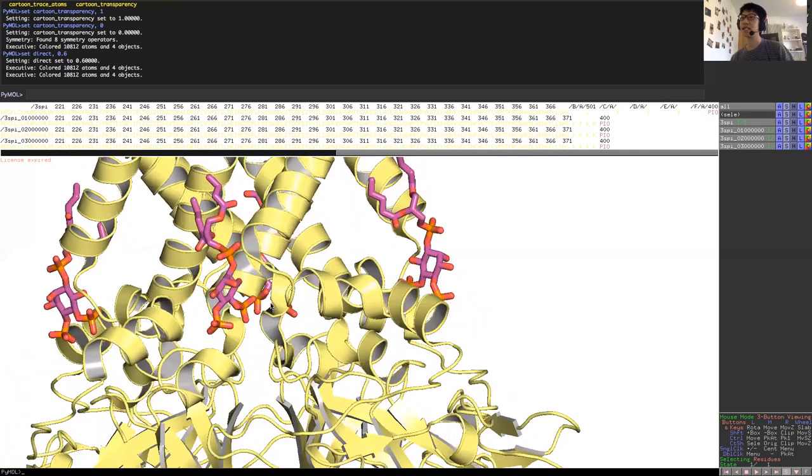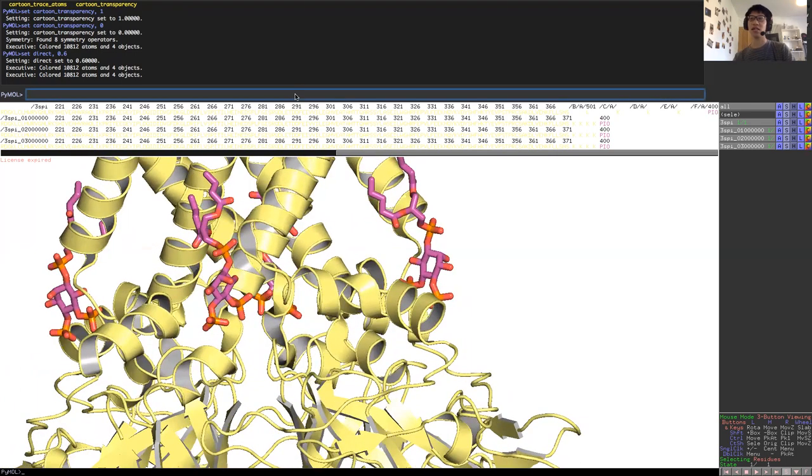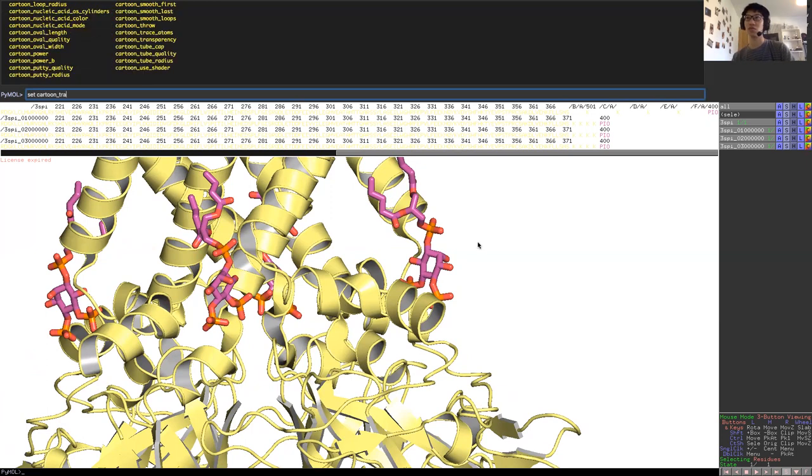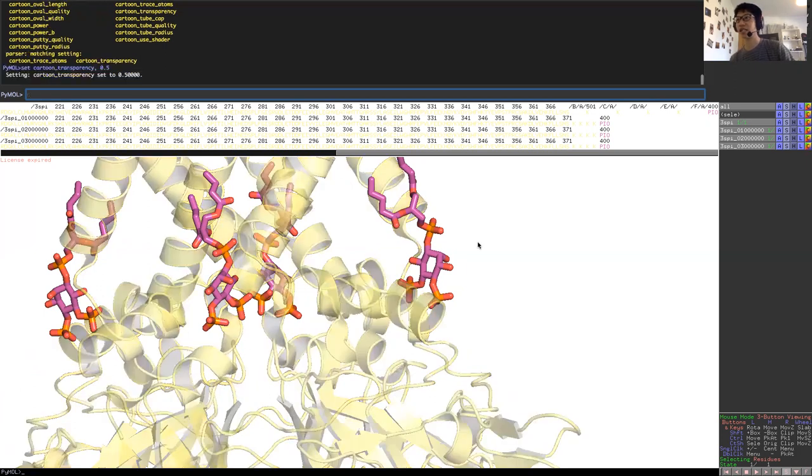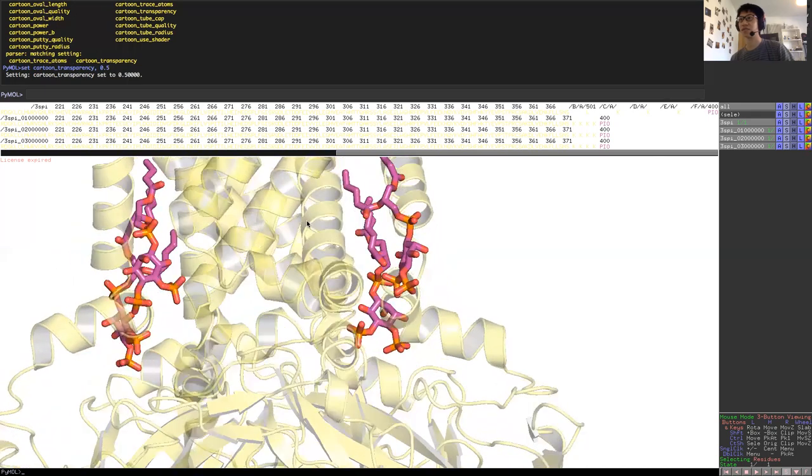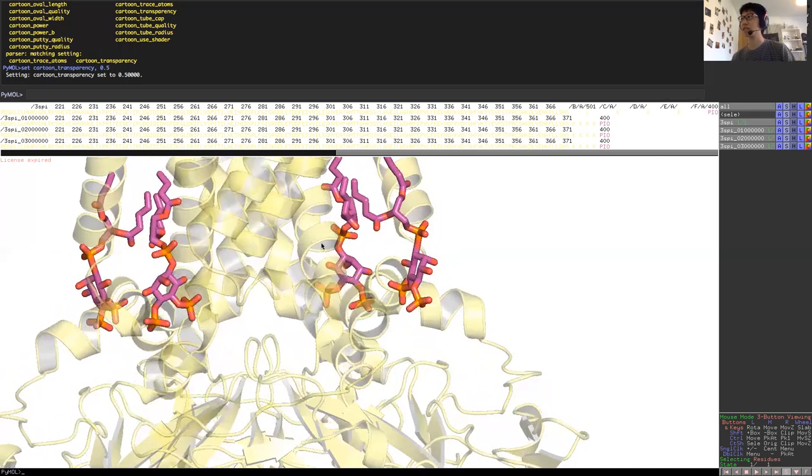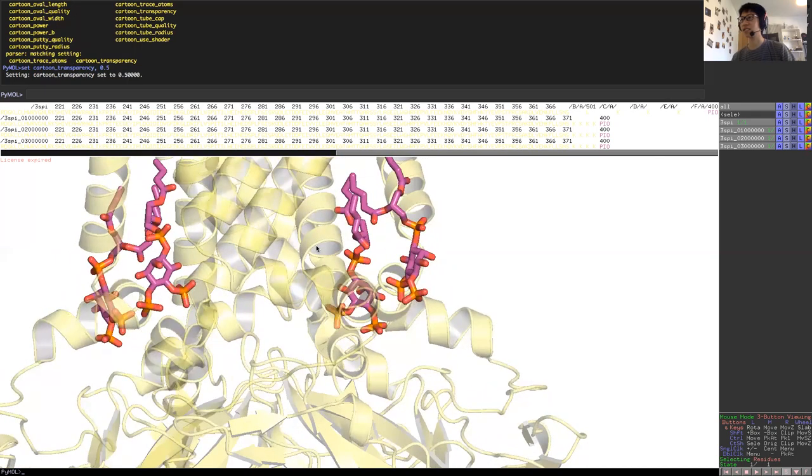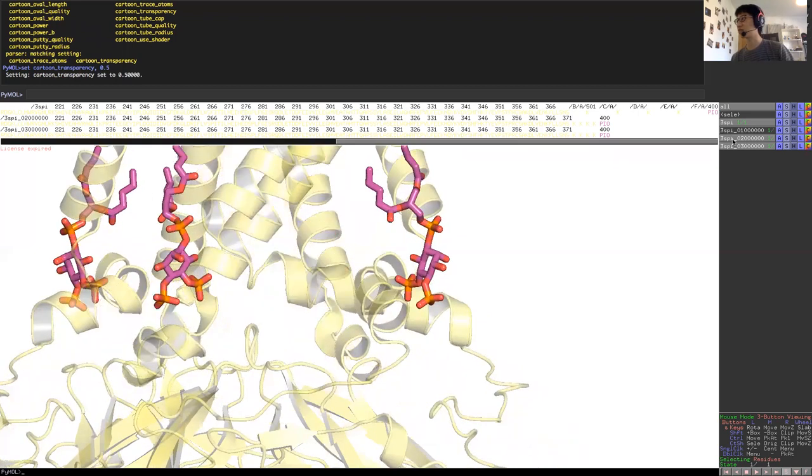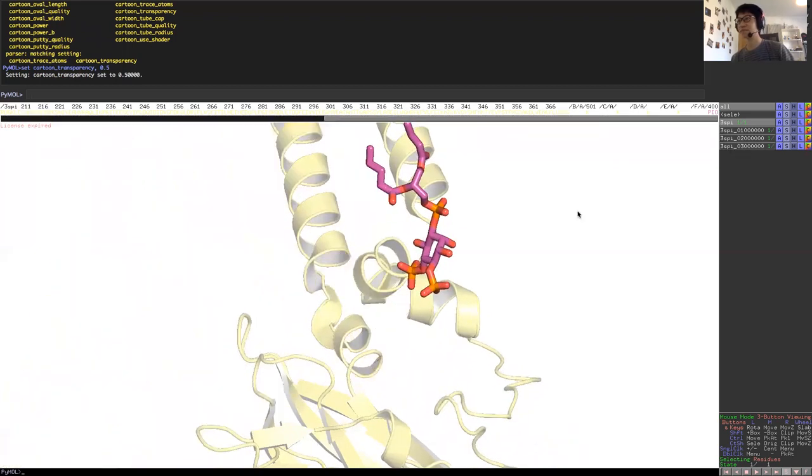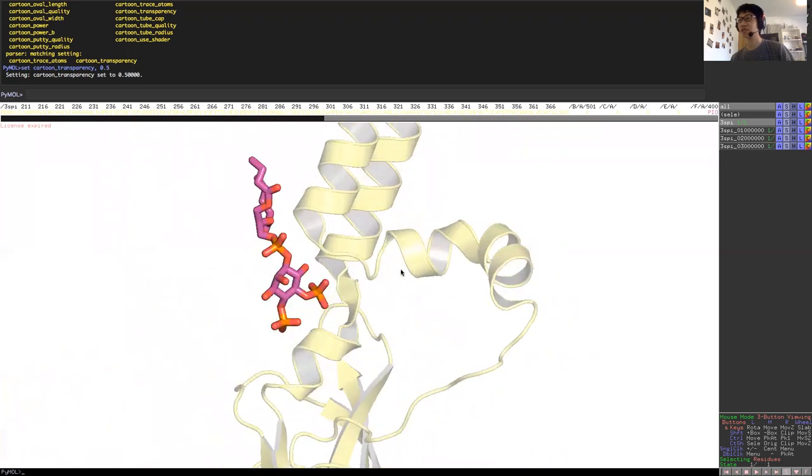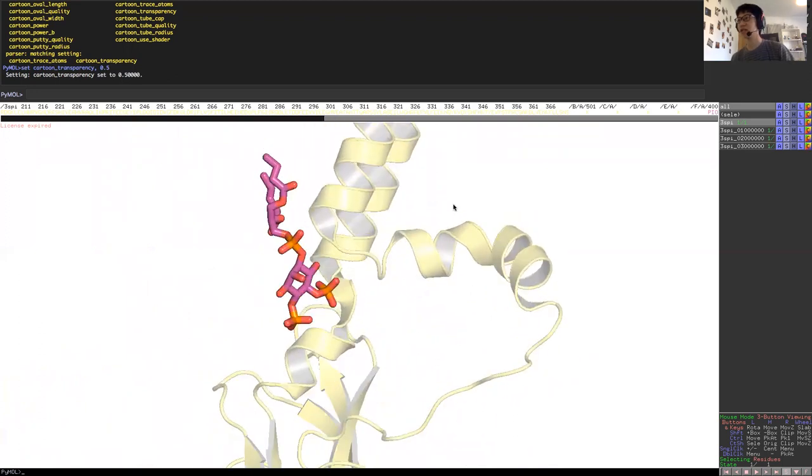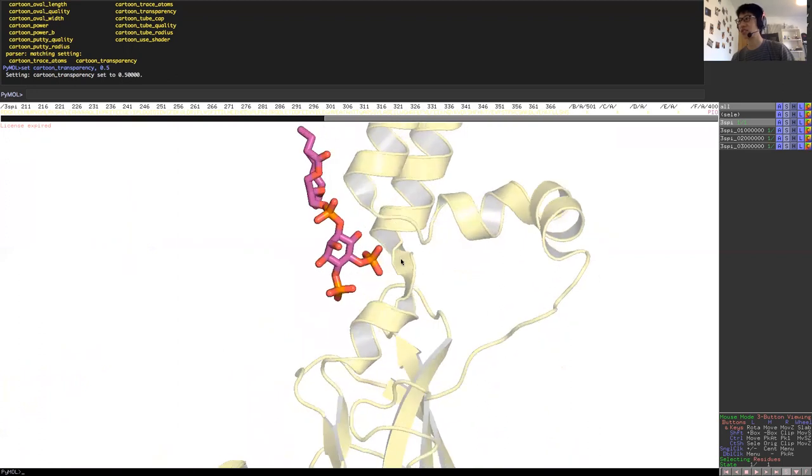To make my life also a lot easier, I would set cartoon transparency down to 0.5 so that I can see mainly the region I'm interested in. So here I'm looking at PIP2 binding site, and ideally I would like to look at this one chain at a time. Here's the chain I'm interested in at the PIP2 binding site of the KIR 2.2 channel.